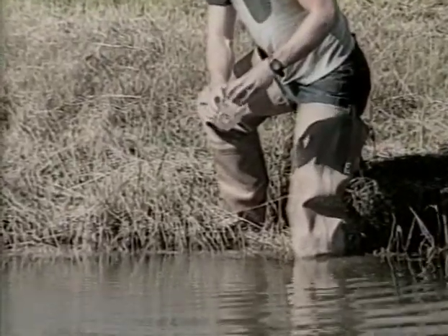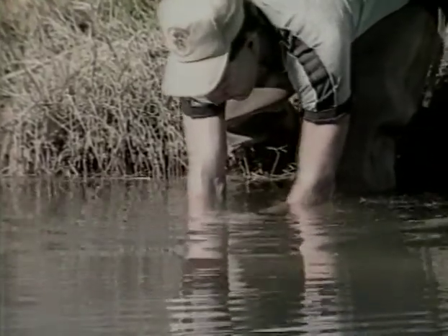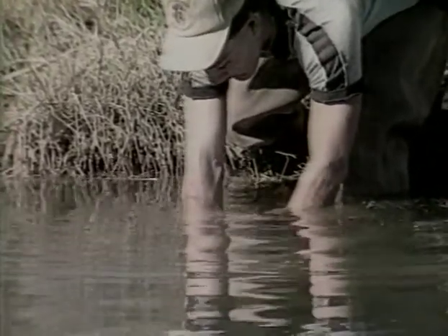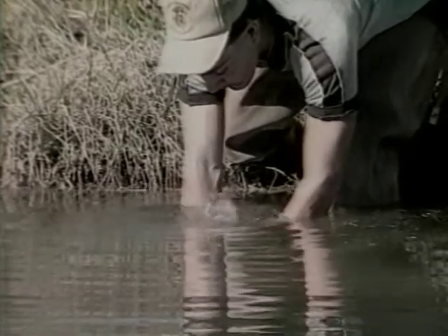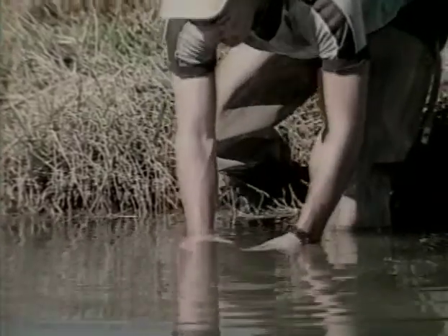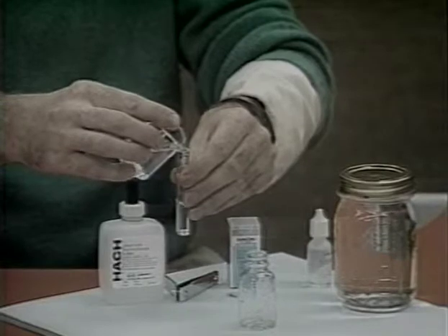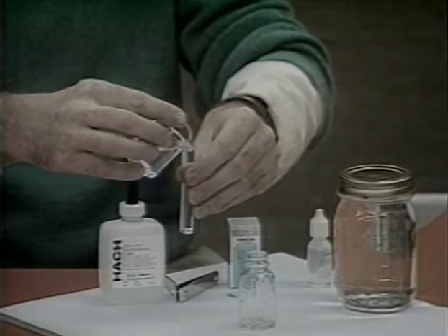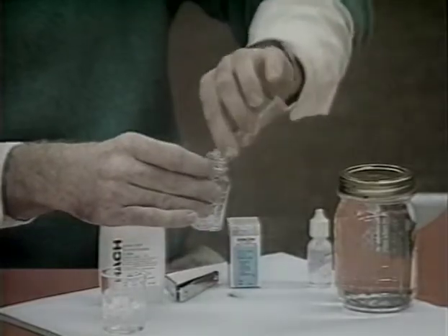Water should be collected away from the pond bank if possible to ensure that stirred up mud will not influence the test. Water should also be collected using a clean container. It is very important to use clean containers to collect water samples, since residues in the jar or bottle may influence measurements. Once samples have been collected, rinse a plastic measuring tube provided in the kit with water to be tested. Pour the contents of this tube into the mixing bottle.